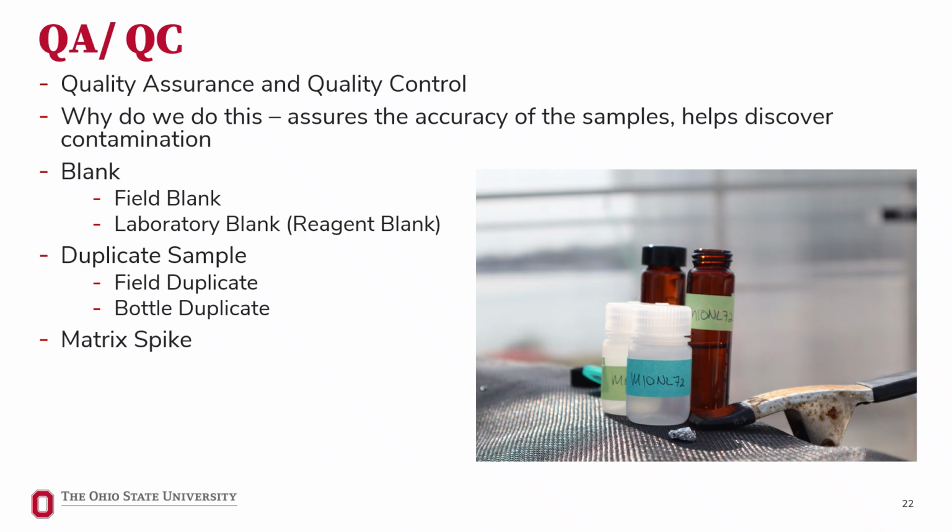This can help look for interference in the samples. Our standards are made using only phosphorus and deionized water, but sample A was water collected from a natural environment containing not only phosphorus, but several other chemicals and minerals that may interfere or react with the analyte or reagents in unexpected ways.